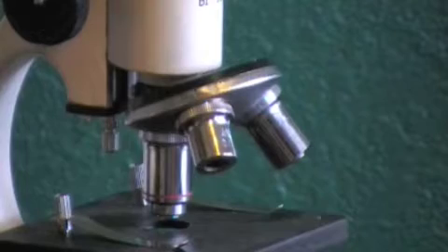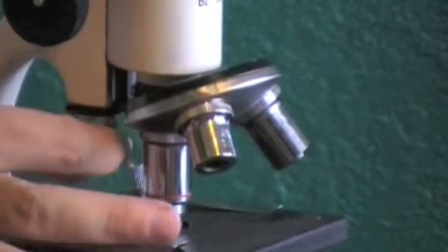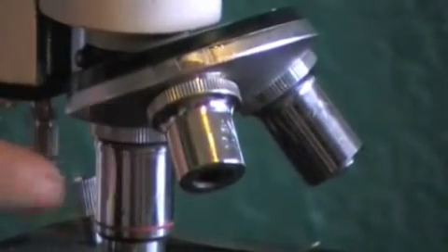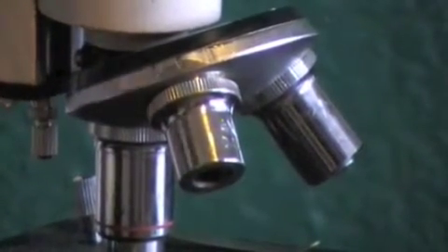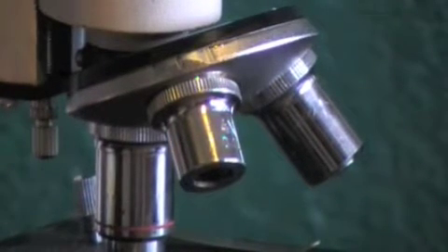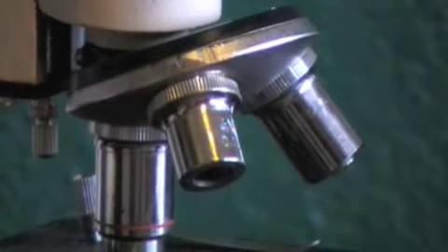And there is a safety feature on most of your microscopes. There's a little screw here. This screw should be all the way in because it's so you can only turn it down so far, to help keep this lens from cracking your slide. But do not count on it. Be very, very careful when you're focusing with the high power lens.